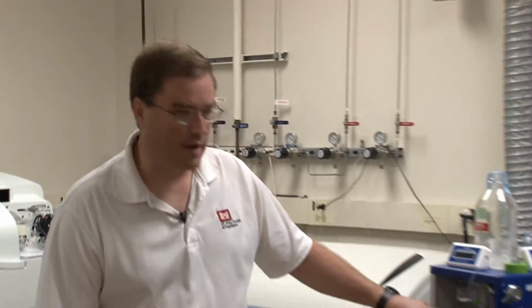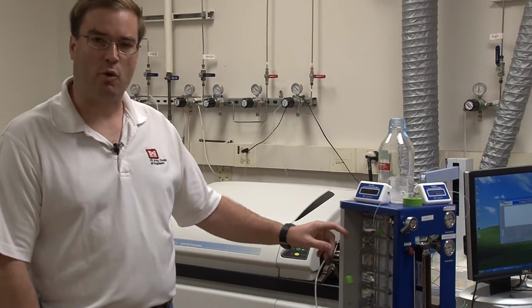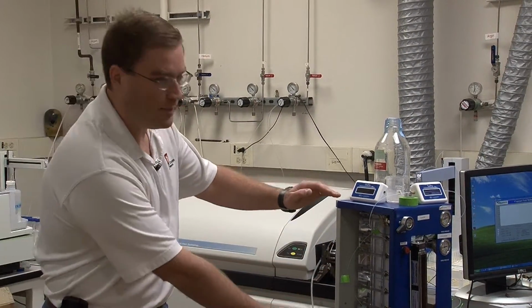When you couple the FFF separation technique to a very elemental specific detector such as ICP-MS or ICP emission, you can get elemental specific detection of nanoparticles at the part per billion after the fractionation has occurred. Field flow fractionation is a chromatography-like technique that separates nanoparticles based on physical forces rather than chemical interactions with a substrate or a media. Specifically, in this column, you have a very thin channel that's about 1/4 of a millimeter thick and about 30 centimeters long.